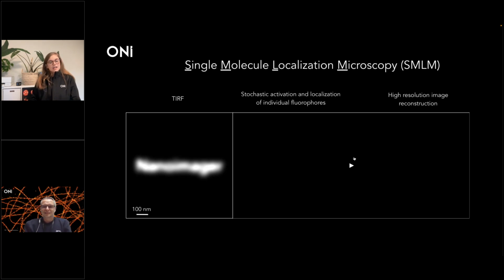And Stefan, can you just briefly mention in what scenarios of cell imaging this gain in resolution is very powerful? Yeah, so this is very interesting when you are looking at primary cells, when you're looking at your cells, when you're looking for protein-protein interactions. I will give you just an example from literature or from personal experience.